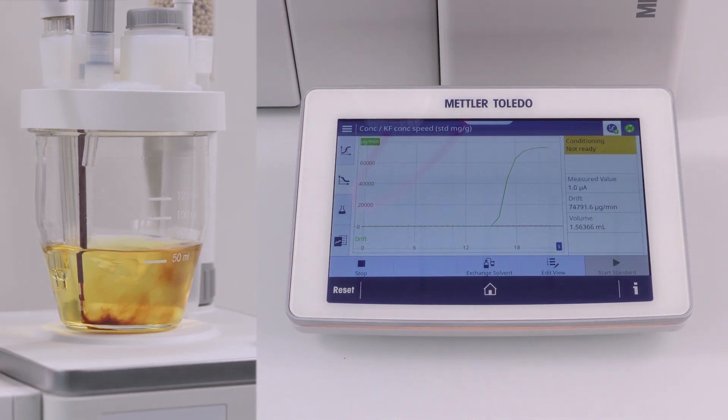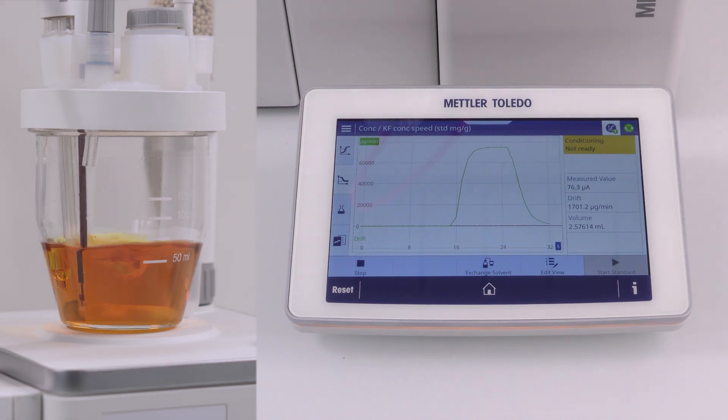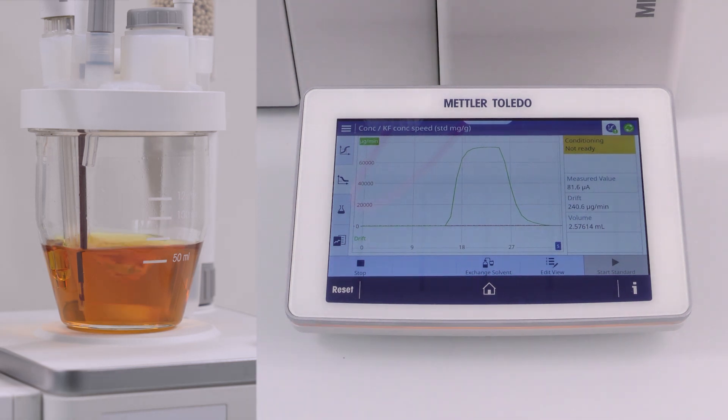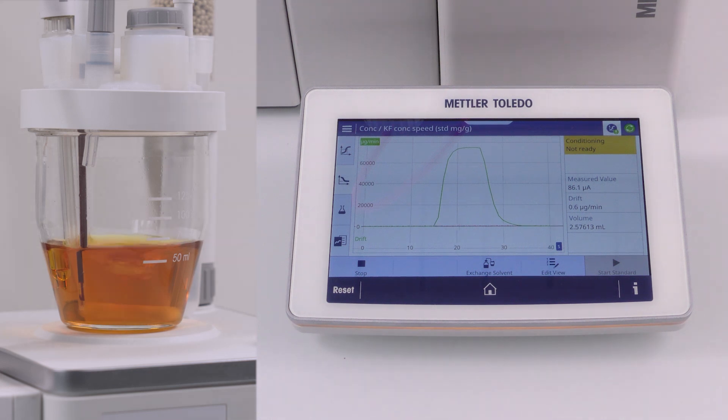The concentration determination adjusts the nominal concentration to the actual one and corrects all the systematic errors of the measuring system. Ultimately, the actual concentration of titrant determines the accuracy of the sample measurement that we do afterwards. Thus, it is very important to do it frequently and accurately. I suggest you to do it at least once per measuring day.